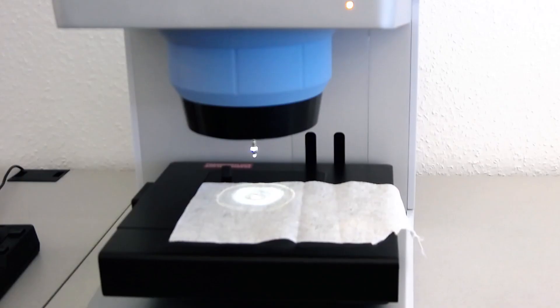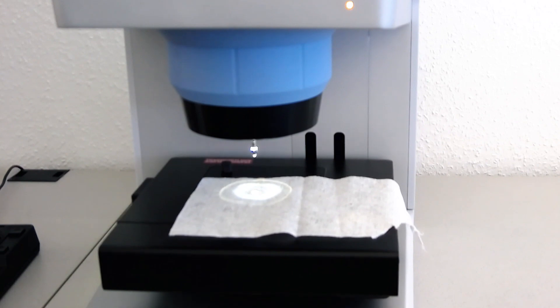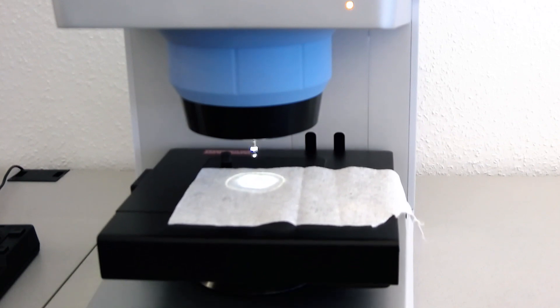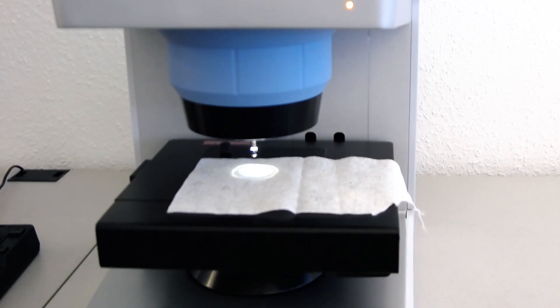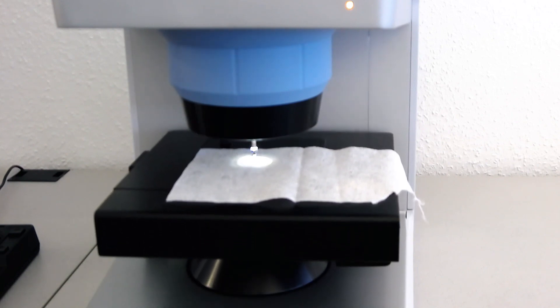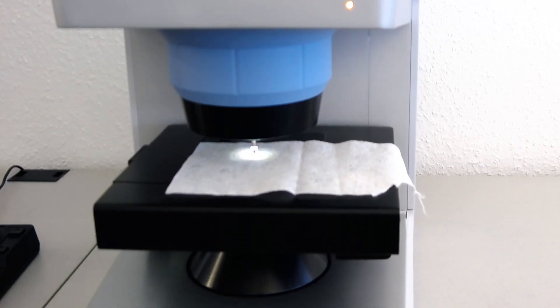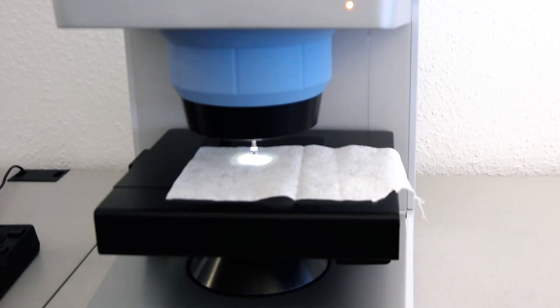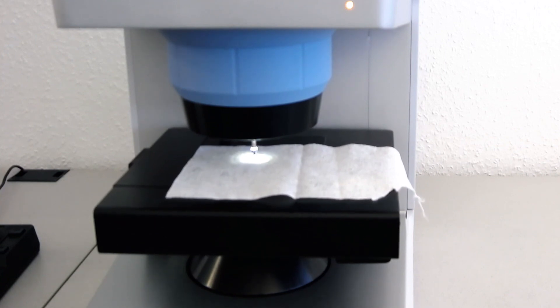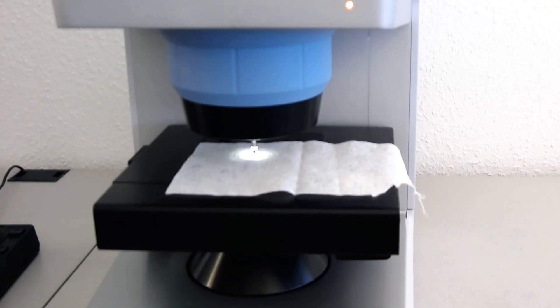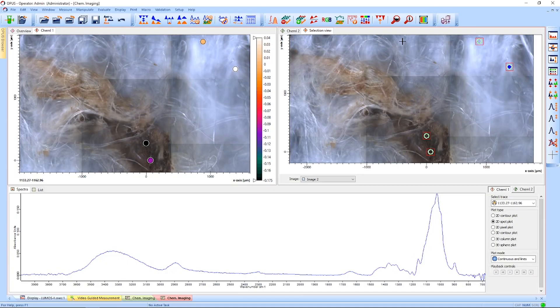Once the analysis begins, the ATR crystal will automatically touch the sample at each of the measurement spots we specified. For each of those spots, an infrared spectrum will be created that can be used to chemically identify the sample.